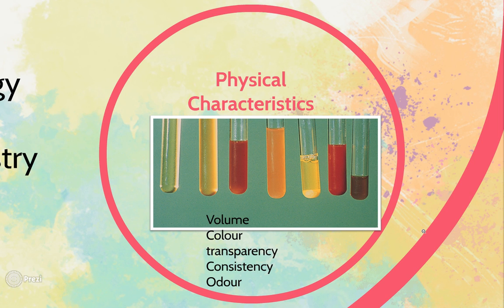And G, I don't know why I said G, it's because I have it written down in alphabetical order. But the last one, we have brown and slightly turbid. When you see it, it could be bile or significant red blood cell breakdown.